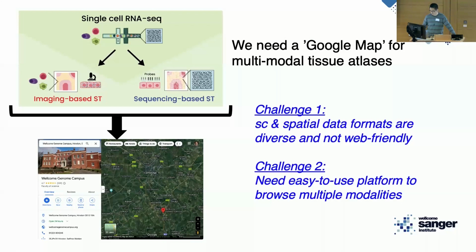In order to tackle these questions, one thing I should mention, if you're familiar with the spatial technologies, you will know that a unified data format is coming out for all the spatial transcriptomic and single cell data sets. But this project and WebAtlas emerged almost at the same time. So our pipeline is not fully adapted to spatial data, but we are actively talking to each other to make sure that we'll be using the unified data format.